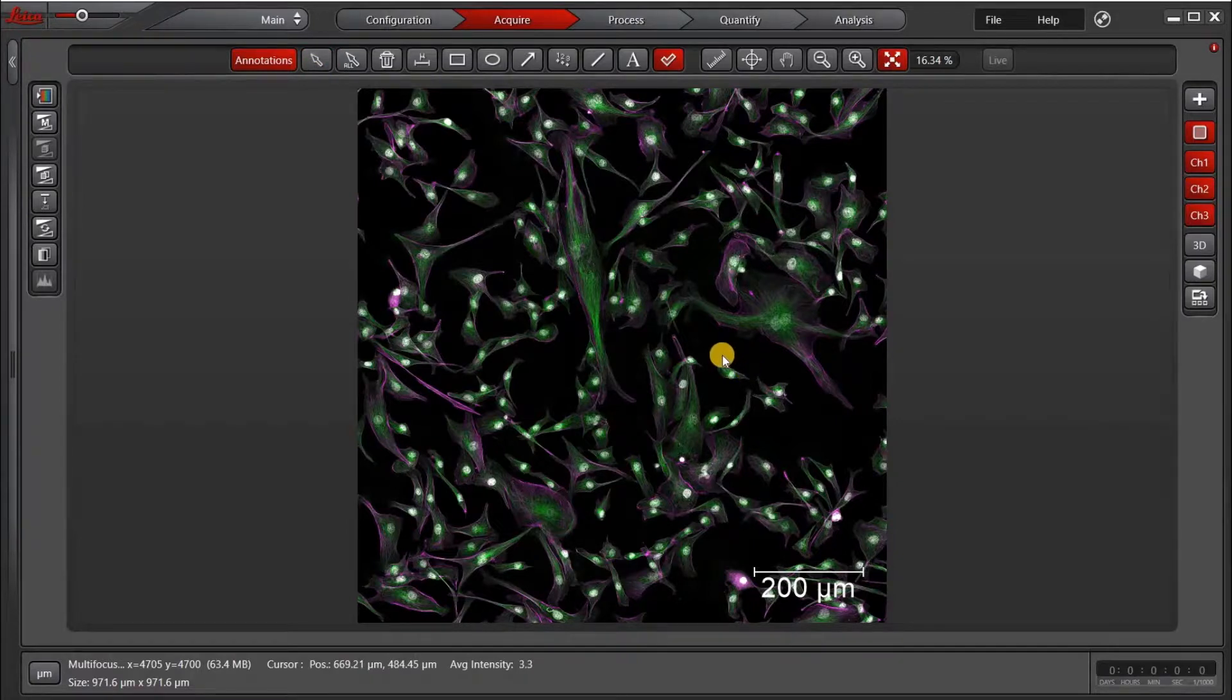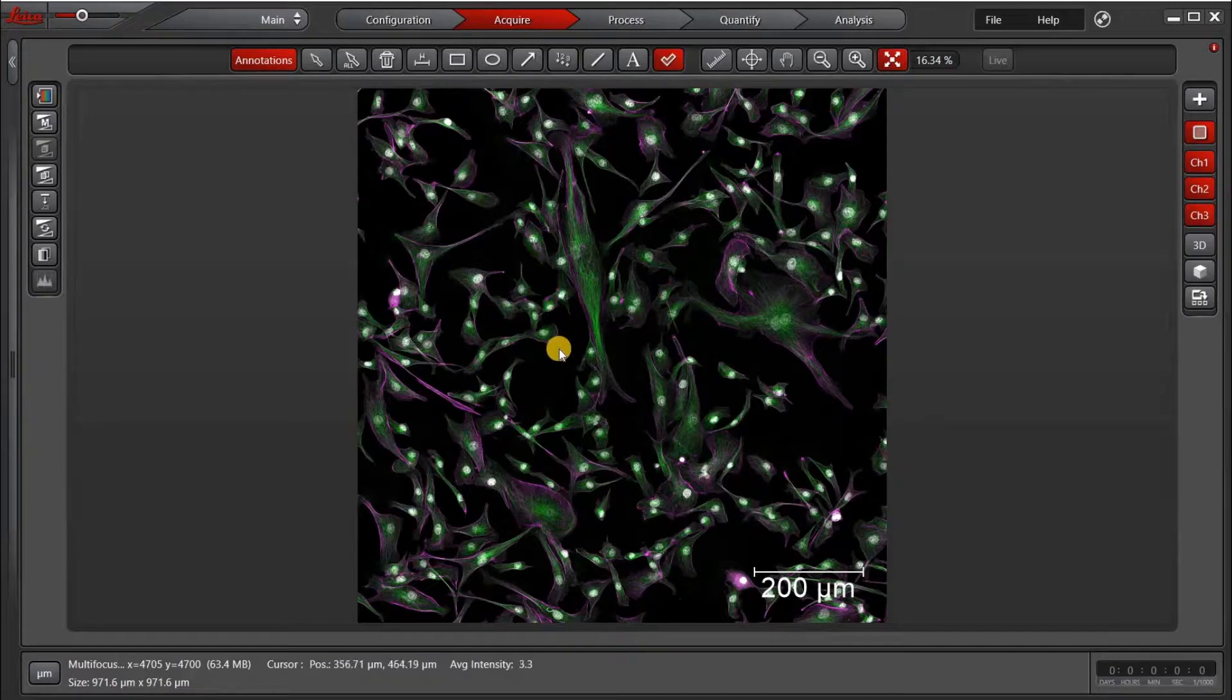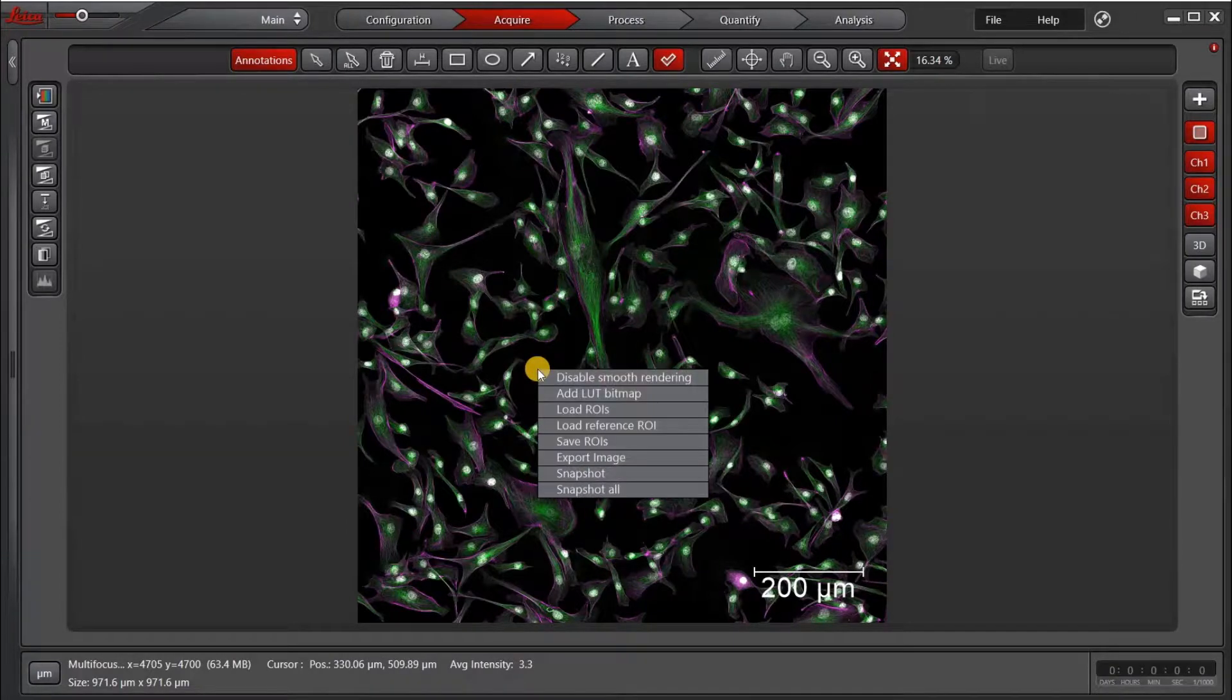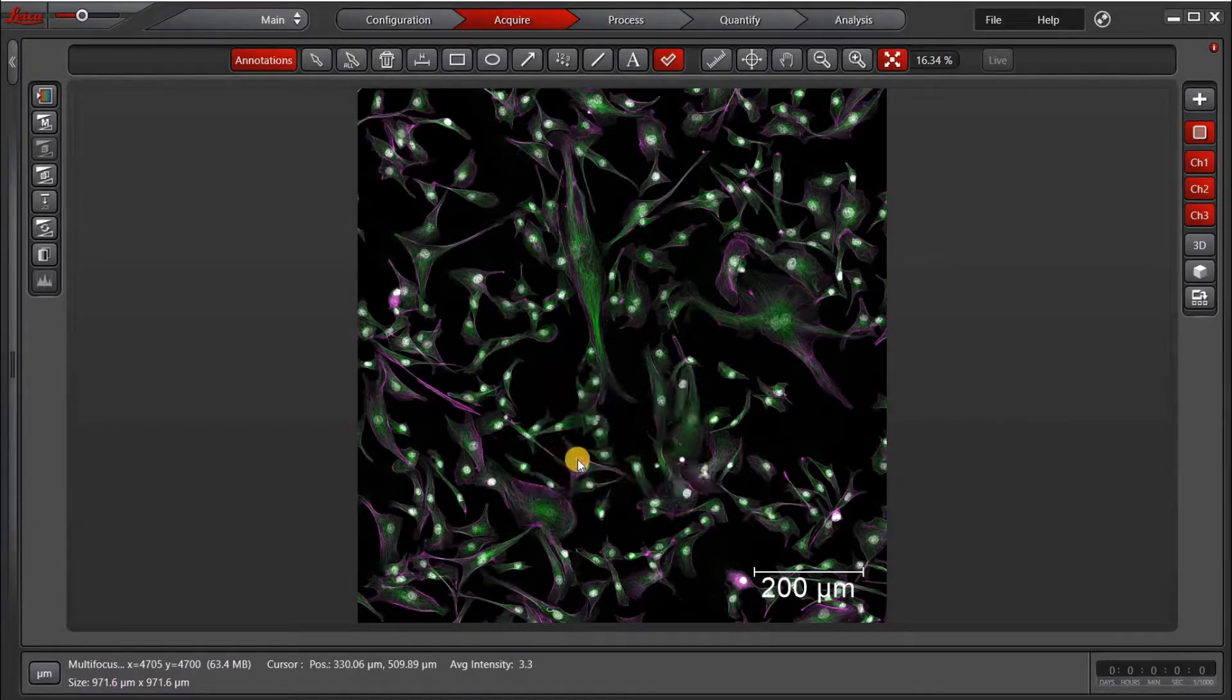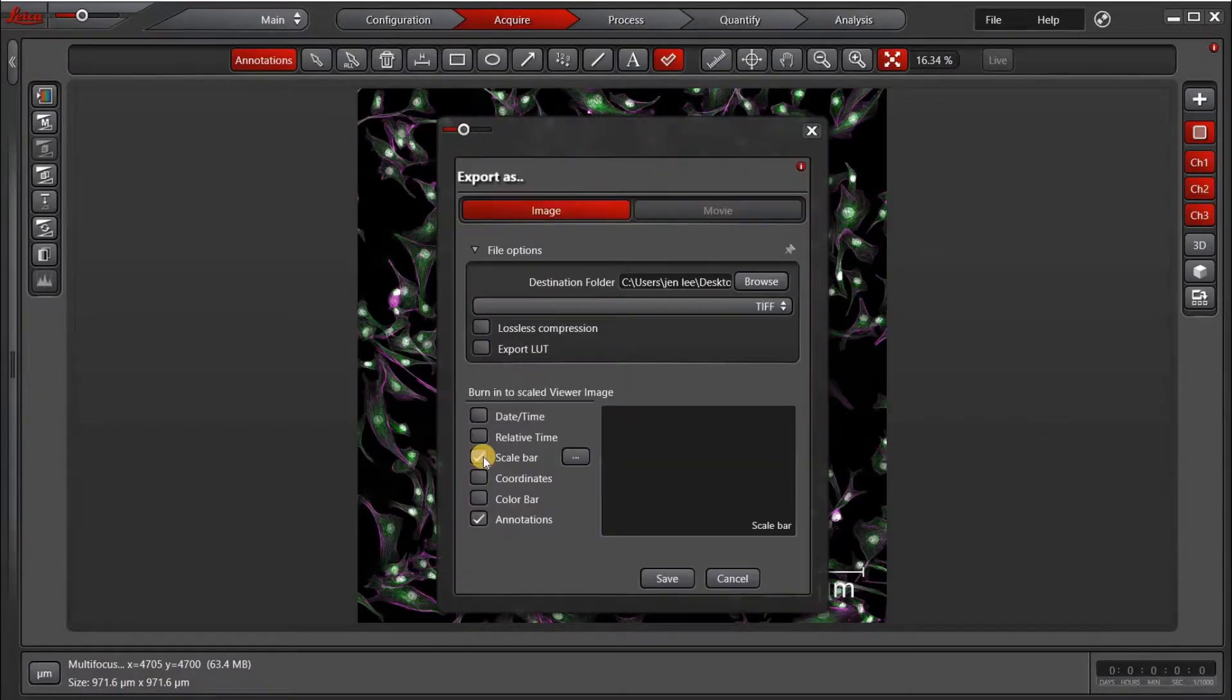Now, for those of you who watched my export video, you'll know that we can also export with a scale bar, and to do that, we right-click on the image, select Export Image, and click the Scale Bar option.